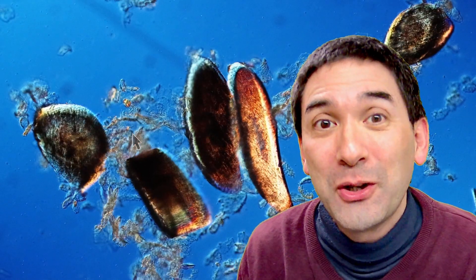And I'm quite sure that those cells that you see swimming around here probably were introduced from the outside, unless they were growing in my face. But I kind of doubt that, with the possible exception of the bacteria.